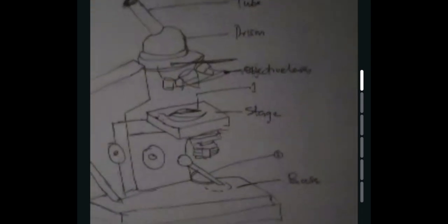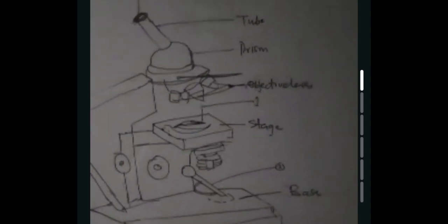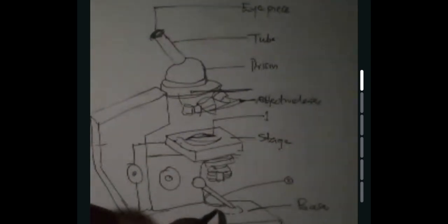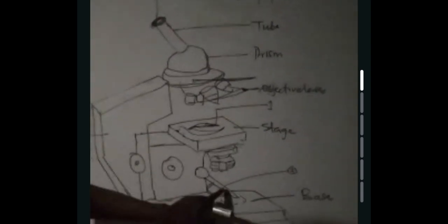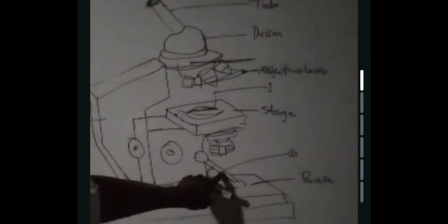Okay, what's this one I'm doing? This one. Anyone? That's the nose piece. The mouthpiece. Concave mirror. The concave mirror is around here. Miss Aminat, are you labeling number 2 for me? Okay, thank you. Concave mirror. I'm right with the pronunciation.